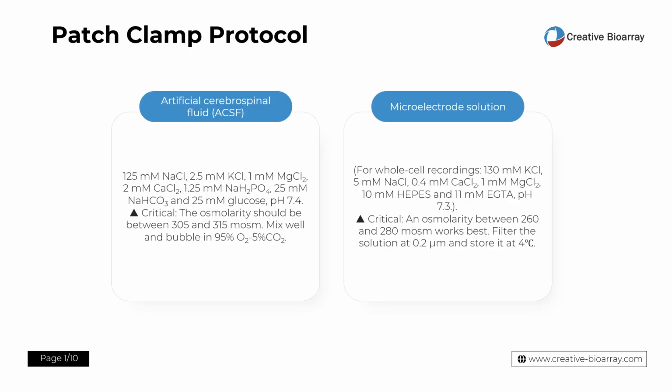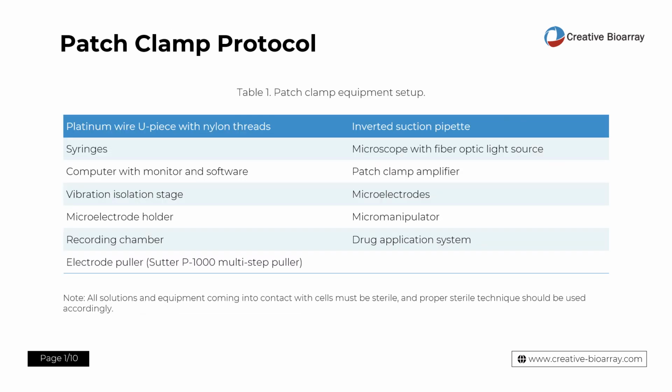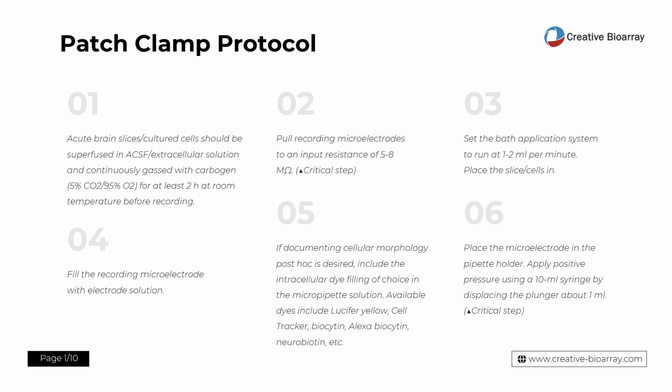Here is a standard protocol of blind patch clamp. The required reagents are as follows. Here are the equipments required. The procedure is as follows.